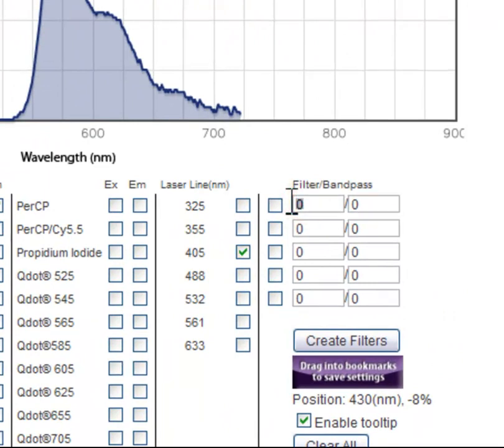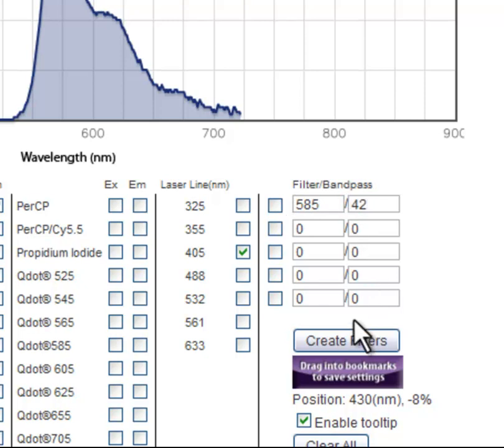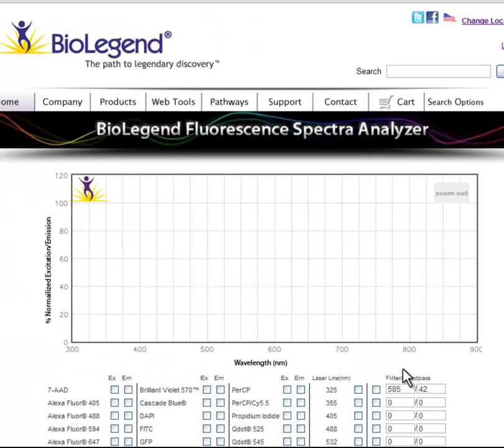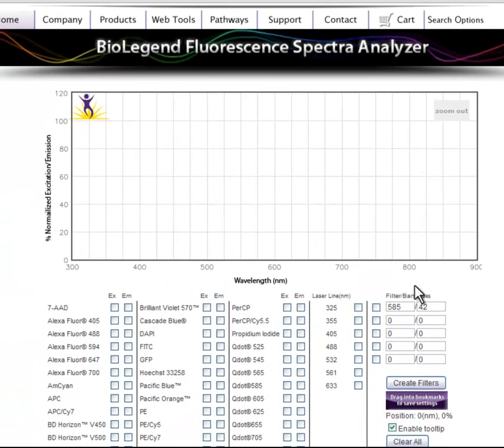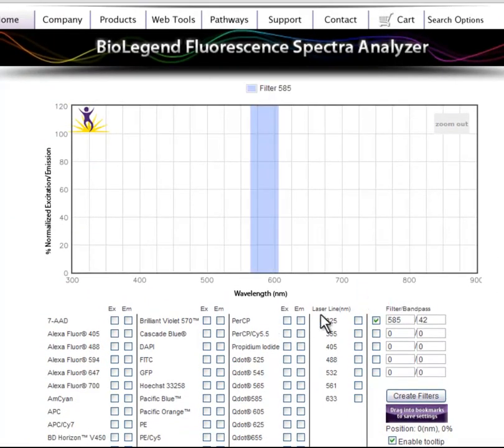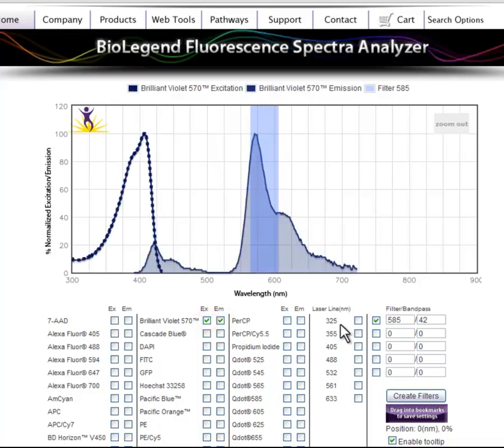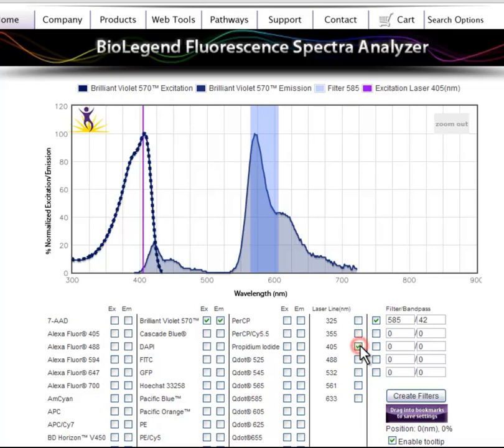To add bandpass filters, type in the desired range into the appropriate fields. You can add up to five filters at a time. Hit the Create Filters button to create your filters, then select the filters you wish to apply. Be sure to create your filters prior to selecting your spectra and laser lines because this button resets the page.